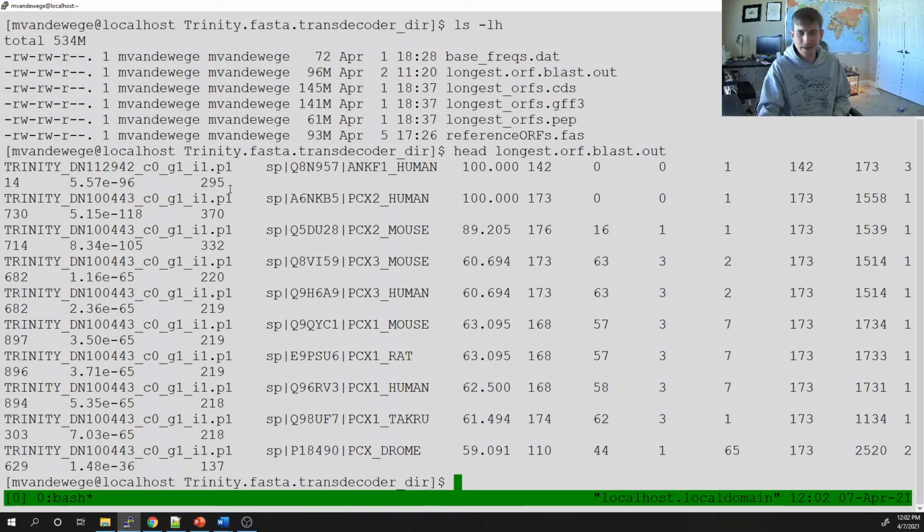Again, there's almost a dozen different output formats that Blast can give you. The tab delimited is the easiest to look at and work with. And so really the only columns that I care about in the default state are the query, the hit, and the E value. Now, sometimes I do care about the bit score. If I'm doing stuff seriously, if I'm really looking around and playing with my stuff, I'll pay attention to the bit score, but not so much for our purposes.